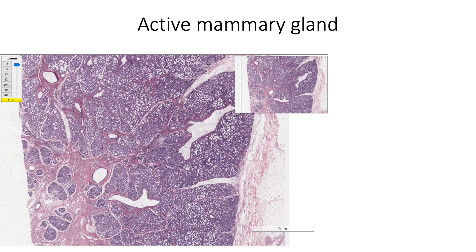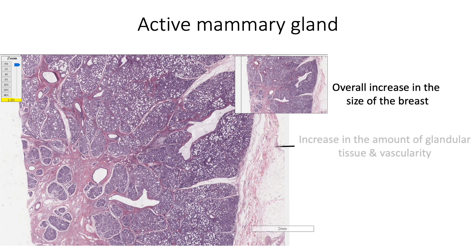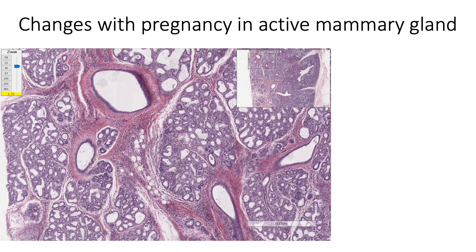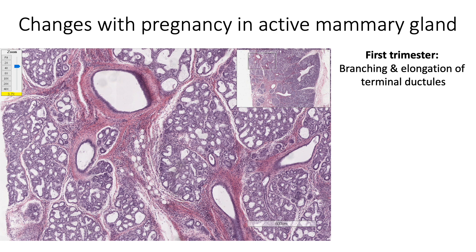The active mammary gland shows an overall increase in the size of the breast. There is an increase in the amount of glandular tissue and vascularity, with a corresponding reduction in the fibrous and adipose stroma. The mammary gland shows progressive changes as pregnancy advances. In the first trimester, we see branching and elongation of terminal ductules in the terminal duct lobular units.